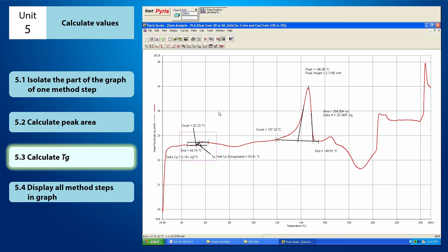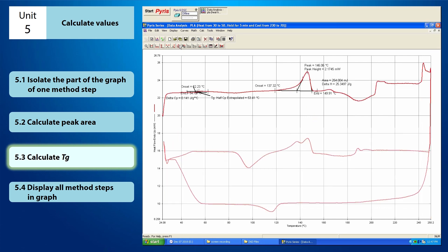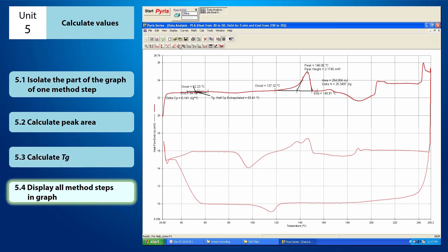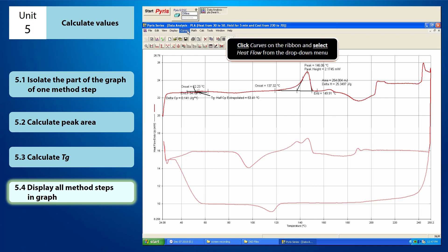If you had enlarged the graph before, click Full Scale from the shortcut buttons in order to view the full graph again. Now you can check whether you still have a calculation to be made on the isolated part of the graph. If there is no more calculation to be made, you can display all the method steps in the graph again. To display all the method steps, click Curves on the ribbon and select Heat Flow from the drop-down menu.